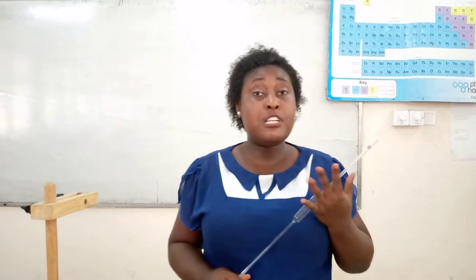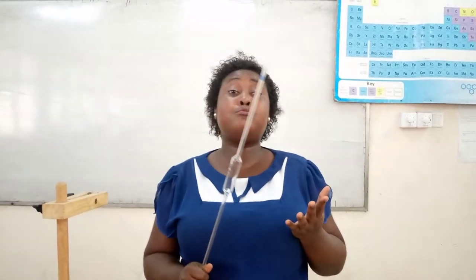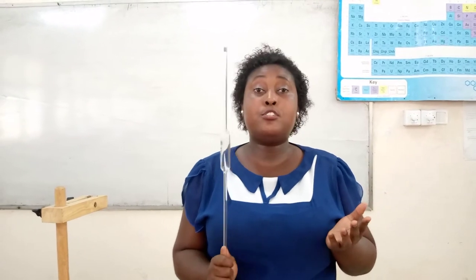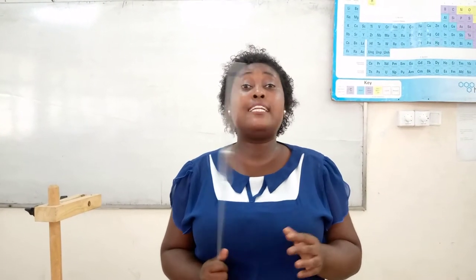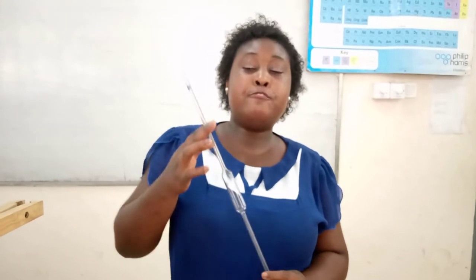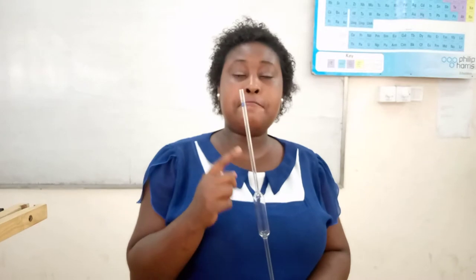After checking if it is calibrated, you have to check if it is clean. How do you know if a glassware is clean or not? When the glassware is clean and you run distilled water through it, the water should be able to flow evenly inside the glassware. When you see droplets of water forming on the insides of the glassware, it means the glassware is contaminated. So now I'm going to demonstrate how to clean any glassware, and I'm going to use the pipette as the demonstration.